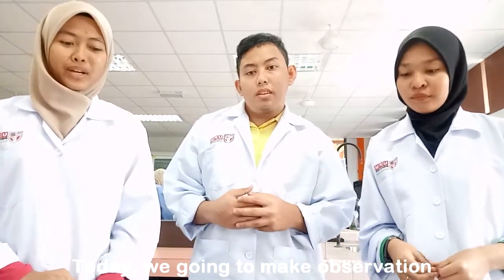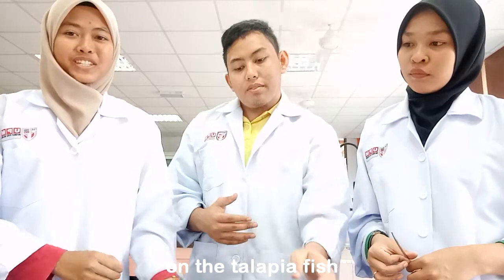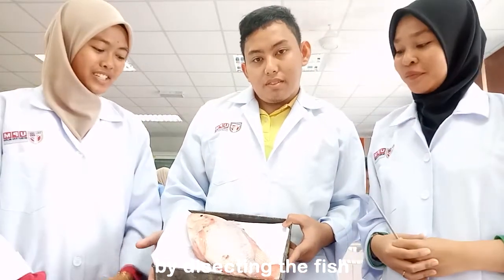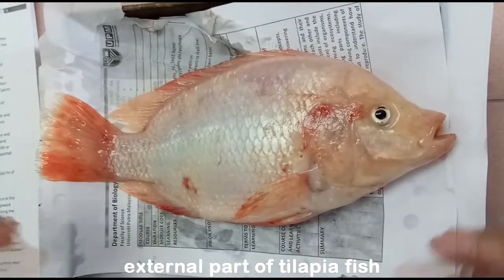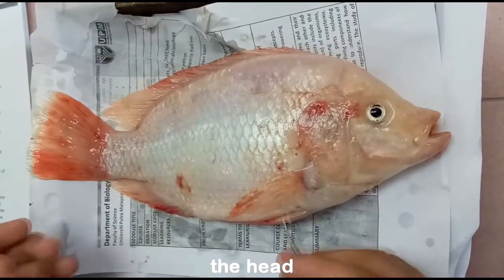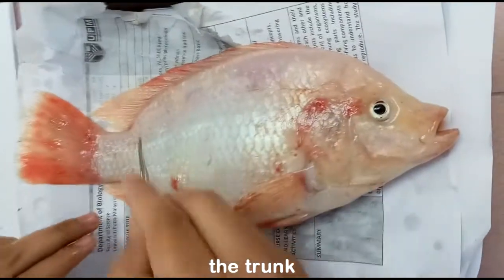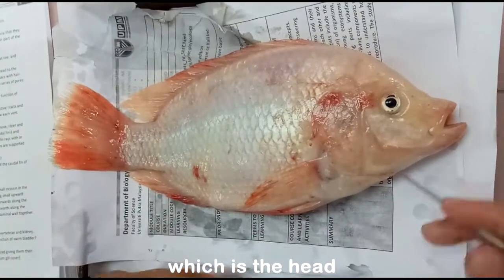So today we are going to make an observation on the external anatomy and internal anatomy of tilapia fish by dissecting the fish. So now let's continue to the external part of the tilapia fish. As we can see, the tilapia fish consists of three parts, which are the head, the trunk, and the tail. So let's continue to the first part, which is the head.